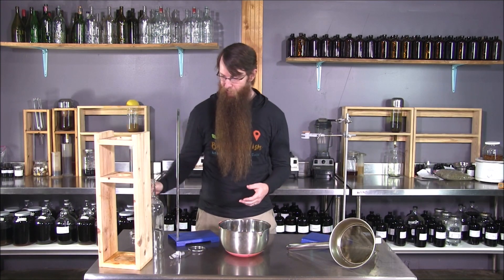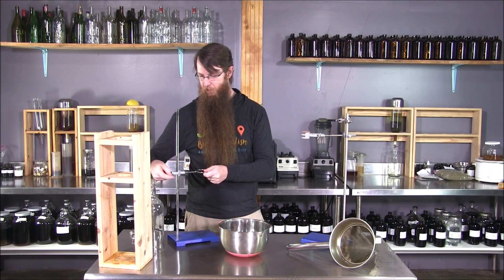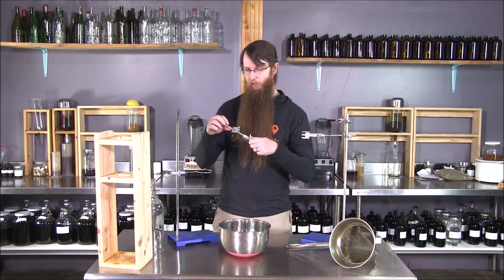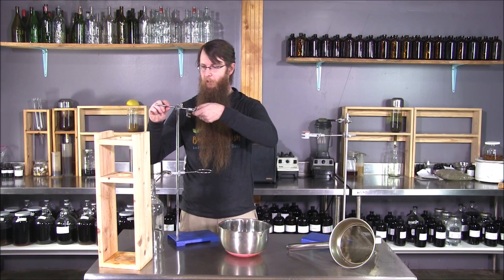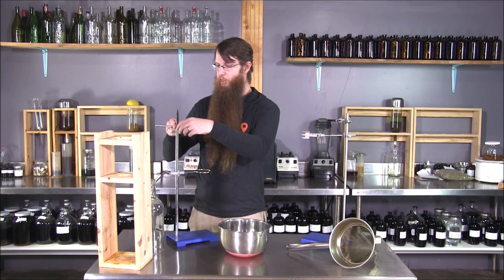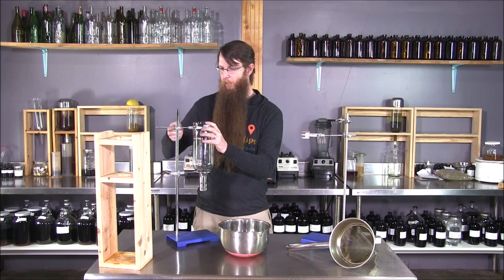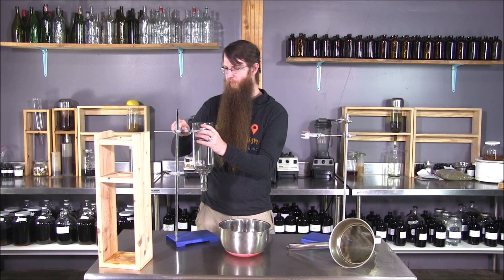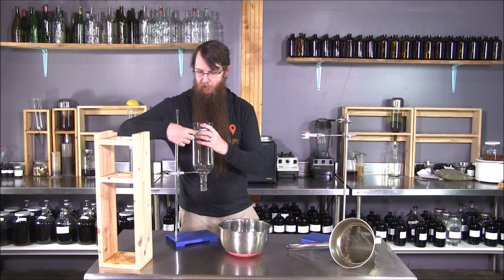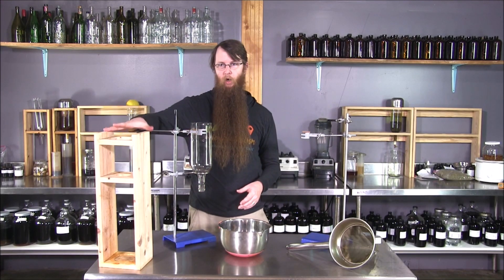To use a lab stand as a perk stand, all you do is take a retort ring to hold the base or the neck of the bottle, and then take a barette clamp. At its most open, it just barely fits around the base of a liter and a half wine bottle, which is my preferred percolation cone. So you take your cone, throw it in the bottle, do a little adjusting on your barette clamp to get it level and where you want. A little tightening up, and now that's not going anywhere — that's a good solid stand and replaces the need for a custom-built stand.